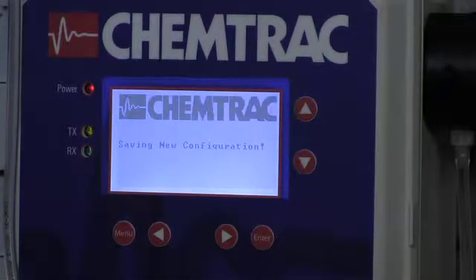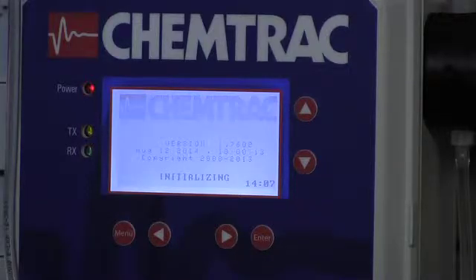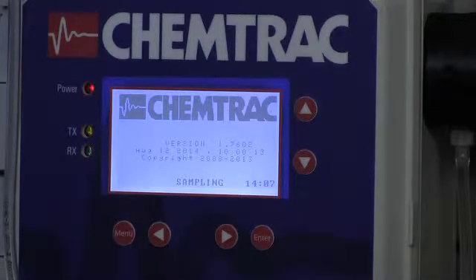That's going to save our configuration, and then we'll keep making sure that our flow is at 75 milliliters per minute. And when this comes out of the save mode, it's going to go into a sampling mode, and it'll just be about 10 seconds, and we'll see what the results are.